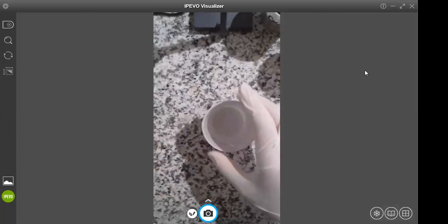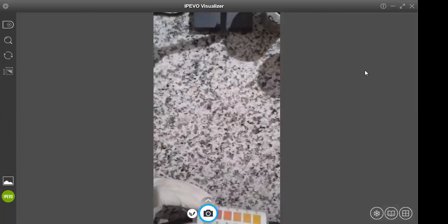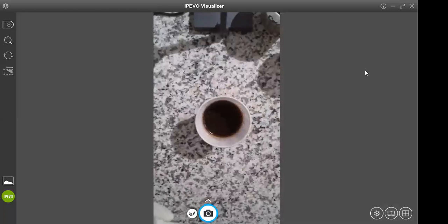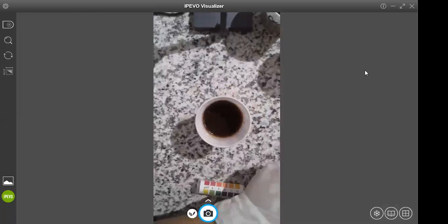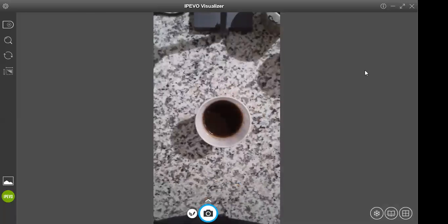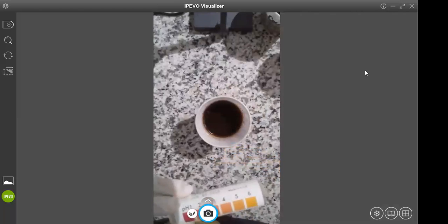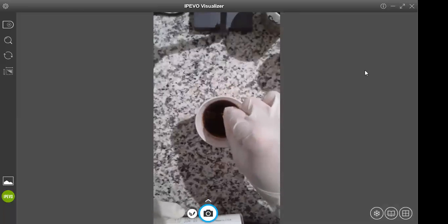So the next solution, and that was water, that was number 6. Number 7, we're going to try one that's leaking everywhere. Actually, we'll do the leaking one last. So number 7, we're going to try coffee. Coffee is something that a lot of people drink every day, and we're going to look at the pH of coffee. Coffee is a dark liquid, so it might actually affect the color of the pH strip, but we're going to make our best estimate in comparison to the pH levels, even with the color on it.